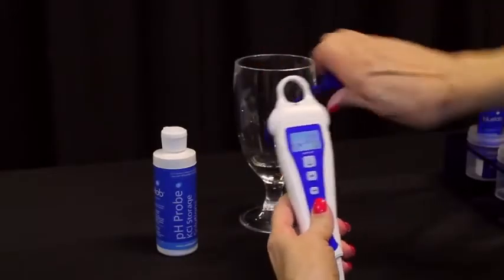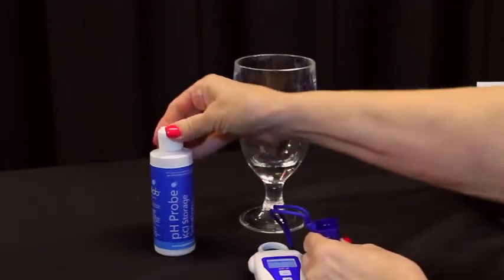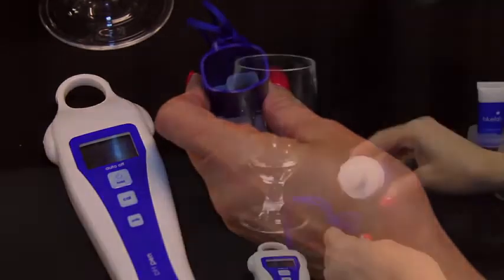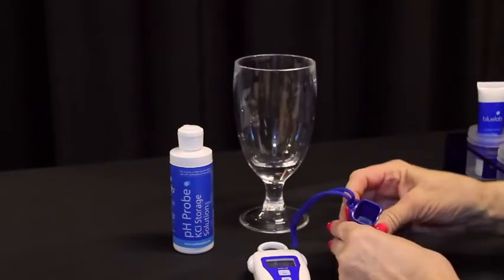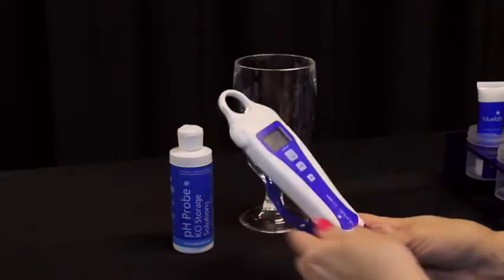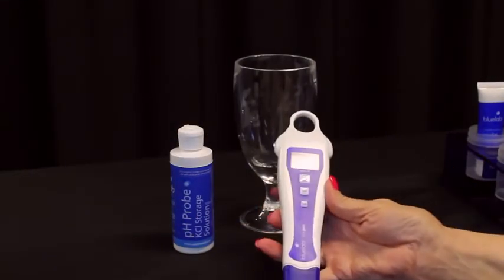Correct pen storage is easy. Add 3 to 5 drops of Bluelab pH Probe KCL storage solution to the round hole of the storage cap. This will keep the probe tip wet. You will need to add KCL storage solution to the cap every week. There is only one way the cap can go on the pen — remember, flat side at front, strap at back. Check and place correctly.